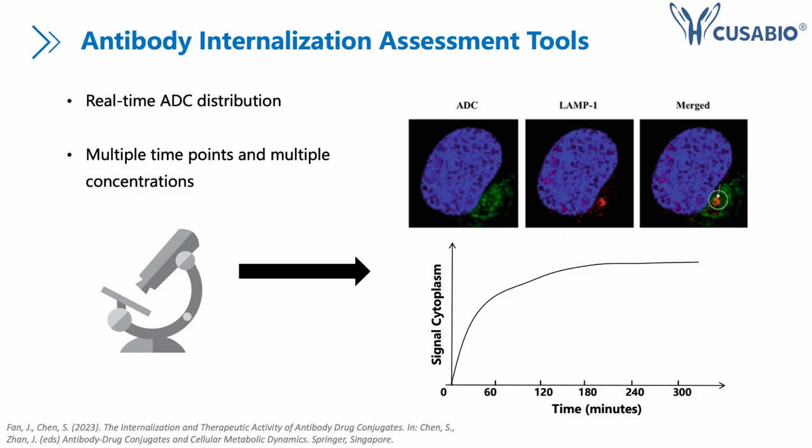You can clearly see the position of the antibodies at different time points. Based on some imaging systems, you can also analyze the data and correct the signal distribution. But for this one, you probably need some imaging instrument.